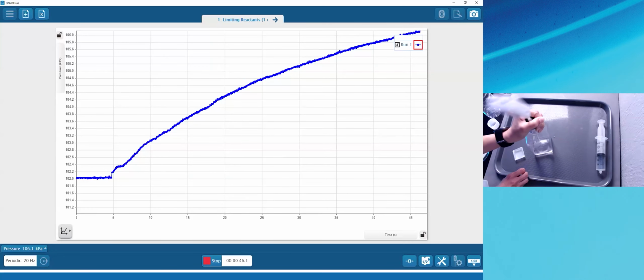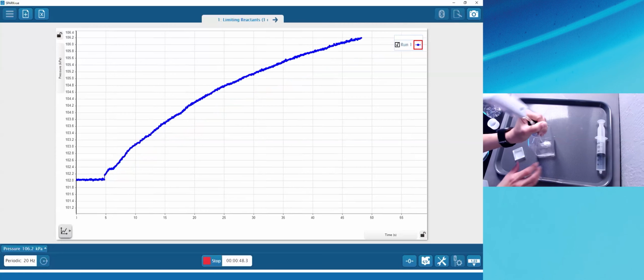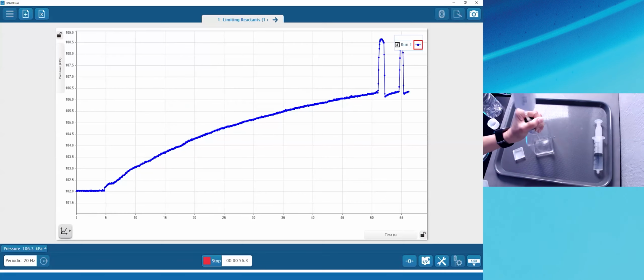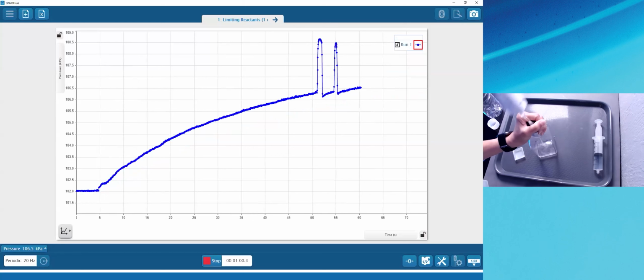And yes, this pressure sensor is sensitive enough. So if the students are not paying attention, they do this and they squeeze the bottle, that shows up in the data. Okay, so it's sensitive. So students are carefully collecting the data, and I'm not worried about that. If that happens, it happens. I've got tools where I can analyze without having to touch that data that looks weird. Right? And we can explain what happened.